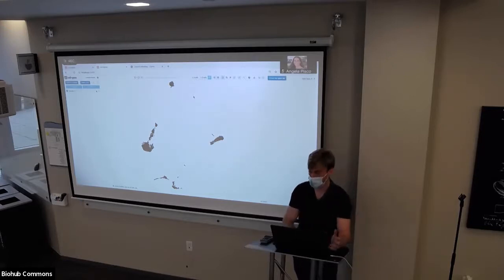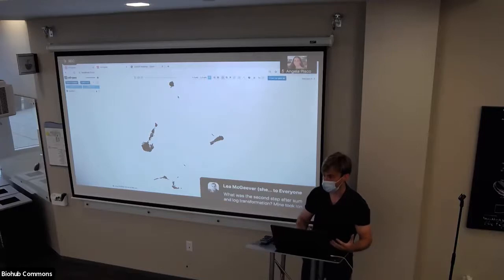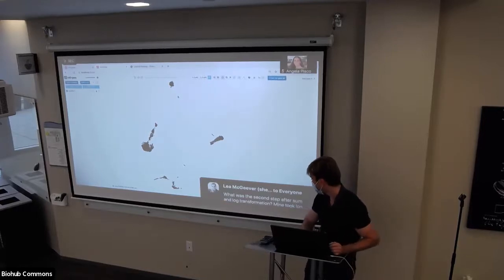what can cell by gene do? First of all, I want to preface this by saying Chan Zuckerberg Initiative did an incredible job making an interface that is lightning fast. It is the fastest interface I've ever seen. It can scale up to millions of cells with no problem. I have tried making interactive explorers on my own using different plotting tools. They were all slower. So this is why I think it's so exciting to build on top of this to enable more features that allow more interactivity.